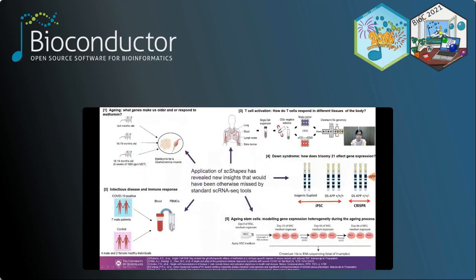For framework development and testing, we use single-cell RNA sequencing gene expression measurements collected from mice on two tissues, adipose and muscle. The primary dataset used describes one of the most common biological designs used in single-cell RNA sequencing experiments, where single cells are profiled from three different treatment conditions: young, old, and another group treated with metformin. However, perturbations to single cells can take on other forms, and therefore we selected multiple other experimental designs to demonstrate how our framework can also identify useful biological results with different scales of complexity present in the data.